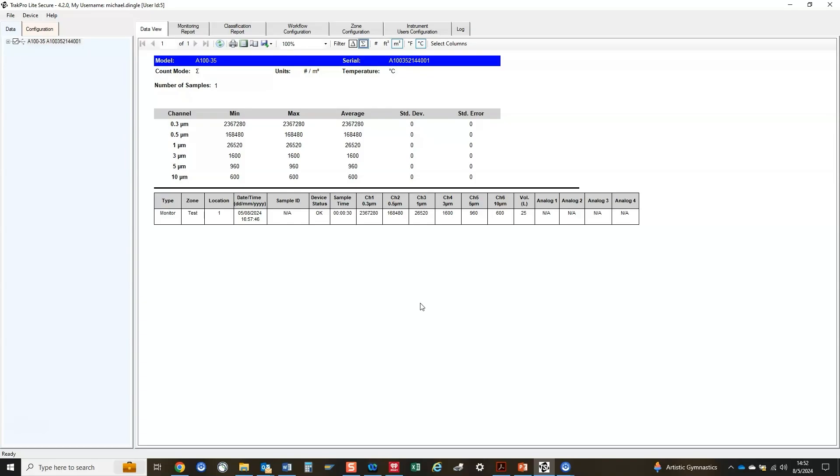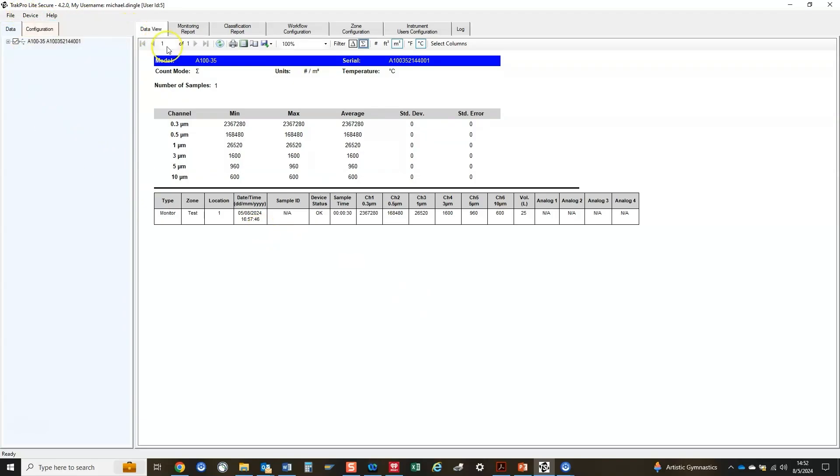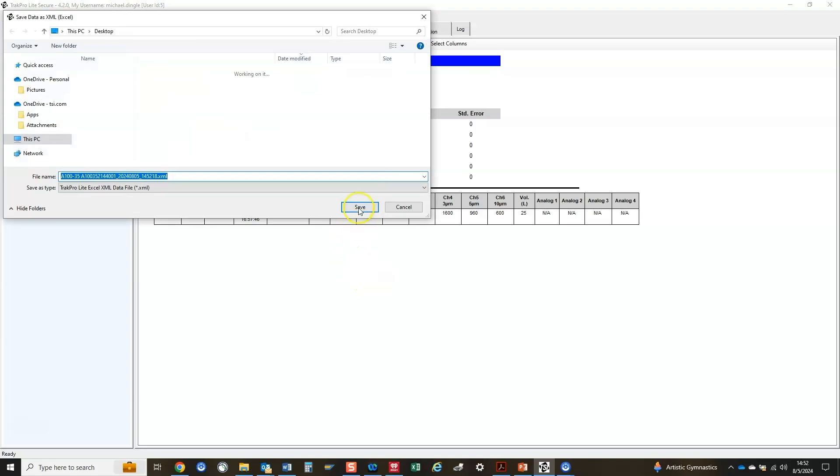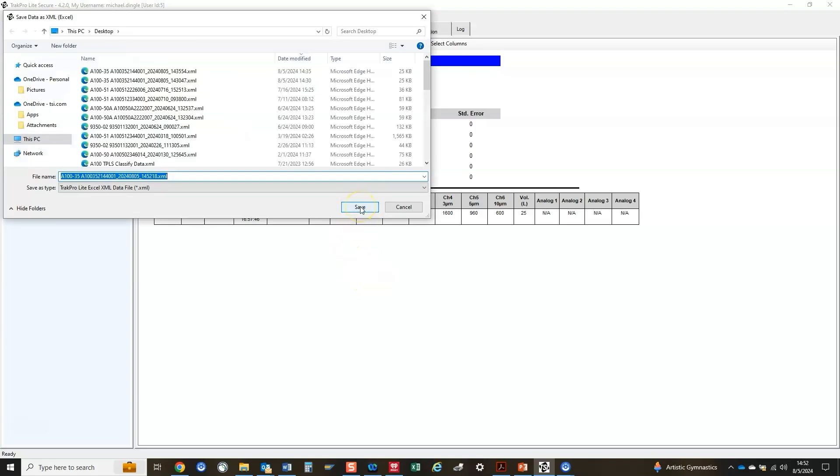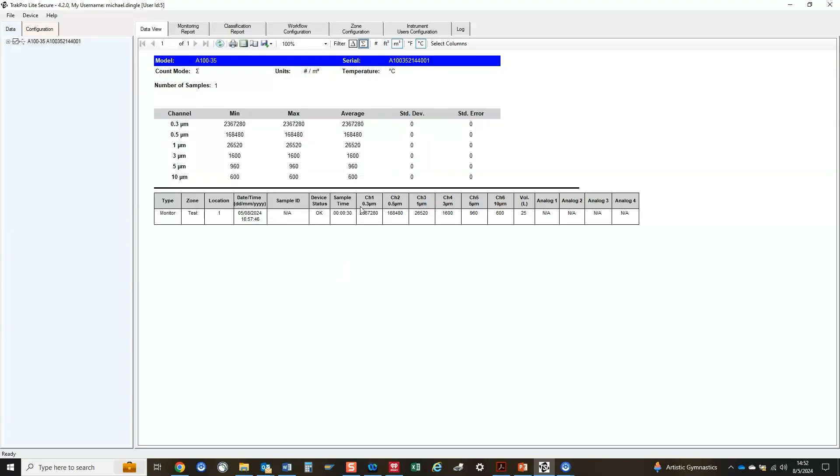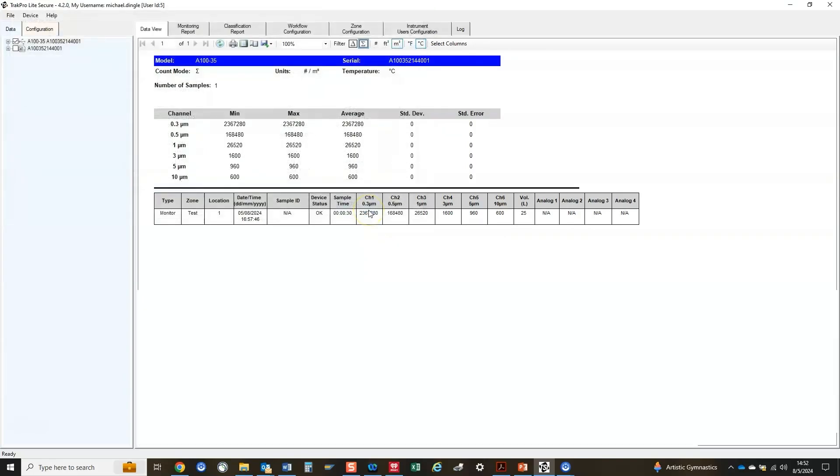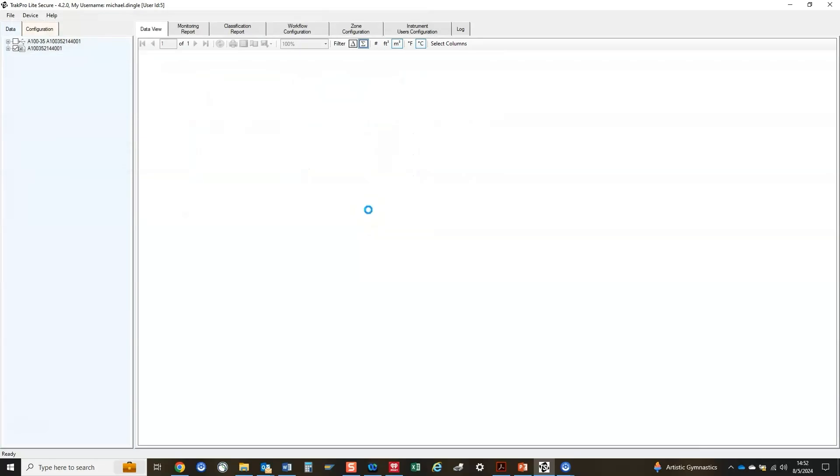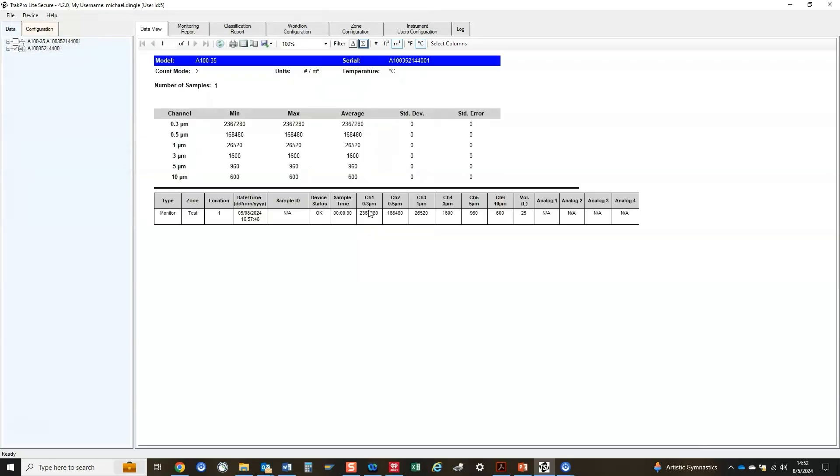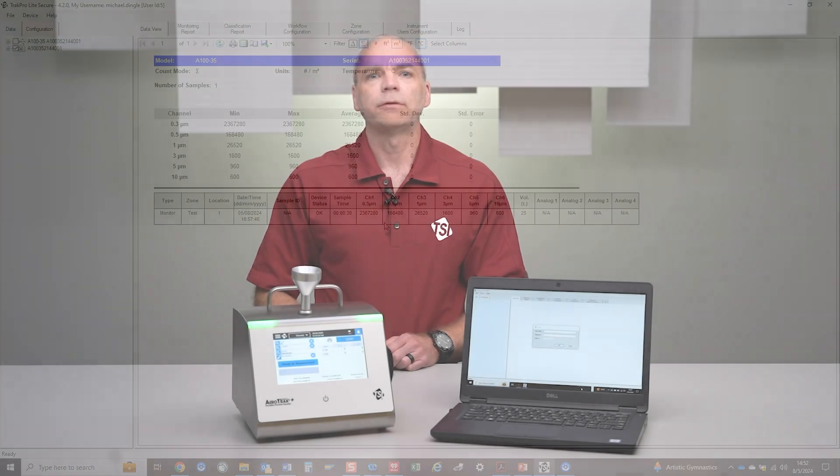The data can also be saved for later viewing by selecting Sample Records under Device on the menu bar and clicking on Save Selected Samples to File. The saved file can be viewed in TPLS by selecting Open Data File under File on the menu bar. Note, the files are saved in a format that is compatible with Excel, so they may be opened and viewed in Excel as well.